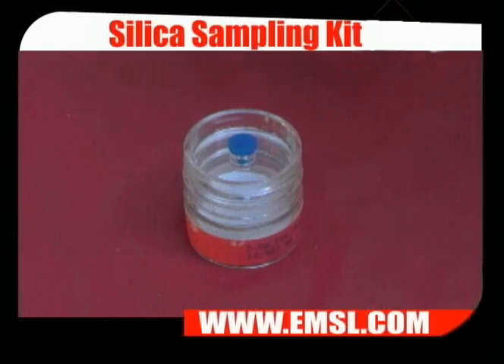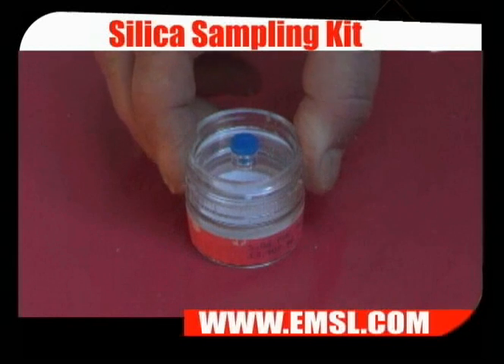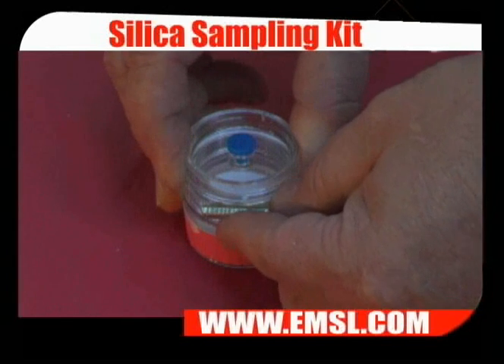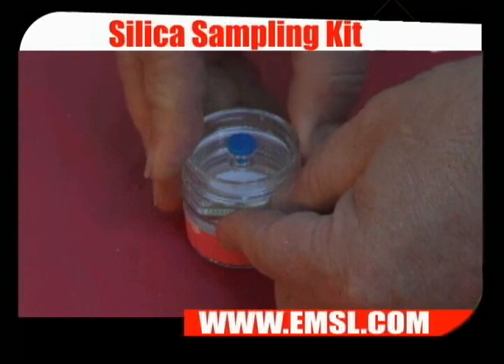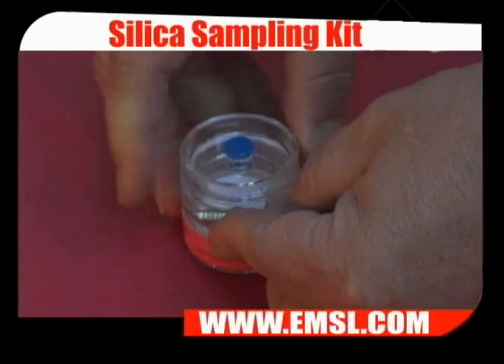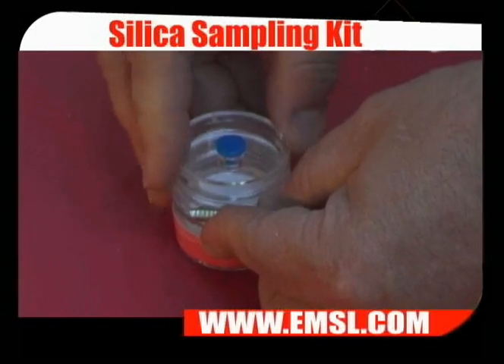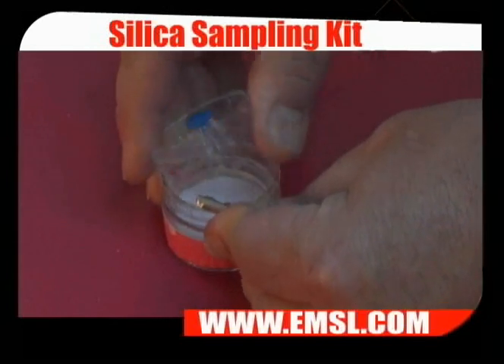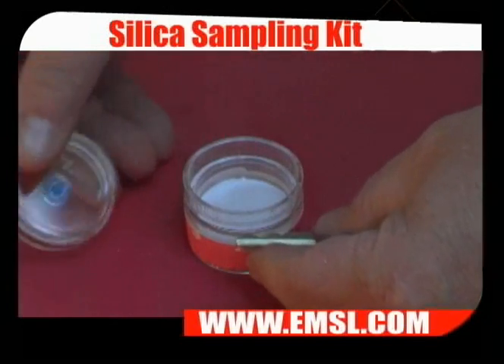To prepare for sampling, locate the inlet section of the cassette. Cut the plastic band at the joint between the inlet section and the center section. Remove the inlet section of the cassette and set it aside.